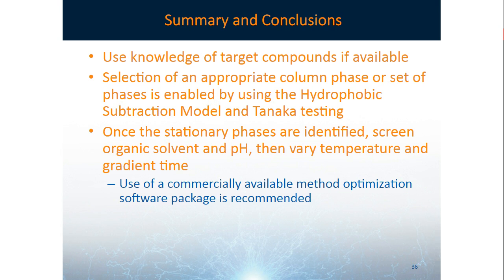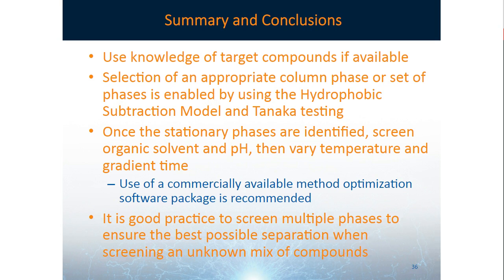And finally, it's good practice to screen multiple phases to ensure the best possible separation when screening an unknown mix of compounds.